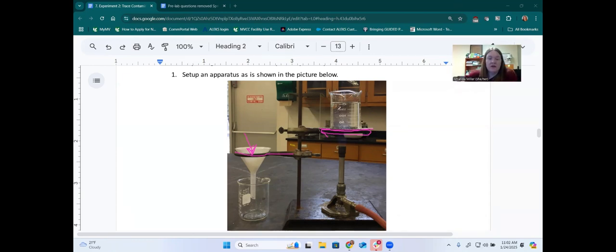So we're going to boil our hot water mixture for a while, and then we need to use beaker tongs. Beaker tongs are located on the side of the room, on both sides of the room. They are not in your drawer. Don't put them in your drawer because other people need to use them, okay? Beaker tongs are one way of handling hot 250 milliliter beakers. We would not use them for beakers that are smaller or larger than that. It's specific to these sized beakers. They fit perfectly right in there.